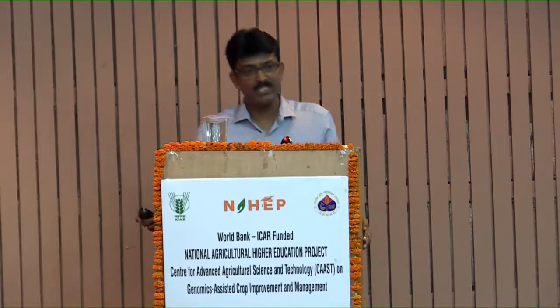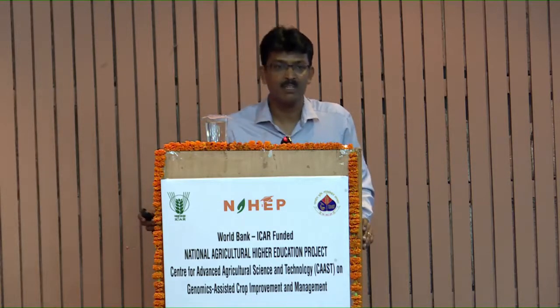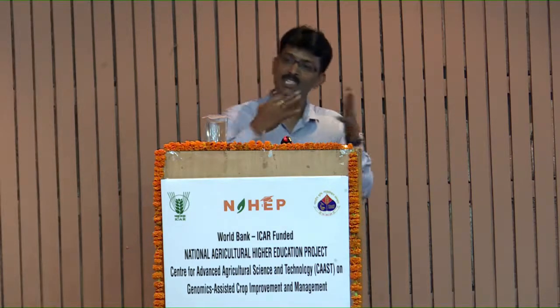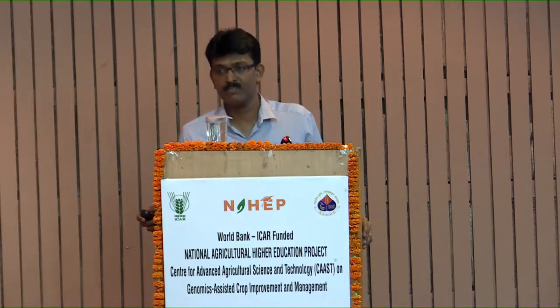So here comes a small twist. This detector can be two different kinds of setup. One is what is called a fluorescent dye. We call it non-specific detection. Another one is specific detection. So a detector is there: one is a non-specific detector, another one is a specific detector. The rest of the slides will discuss this non-specific detector and specific detector.